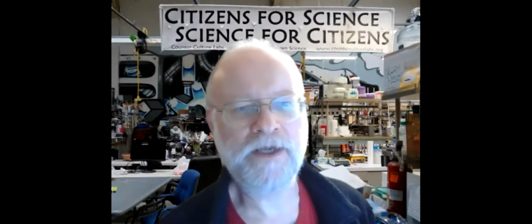Wow, that's funny. I was just about to say something like that. It seems tangible to take a photo, put it to bitmap, and then reverse downscale the color to about 6 of the closest colors, and then translate that into a layer on the website that it could interpret. And there you have an applet that can convert any photo to what works with the OpenTron, and it's all done by software. Yeah, we talked about that. There are little routines out there that can subsample an image in terms of both the color space and the resolution, so you can get something off the shelf that would do that.